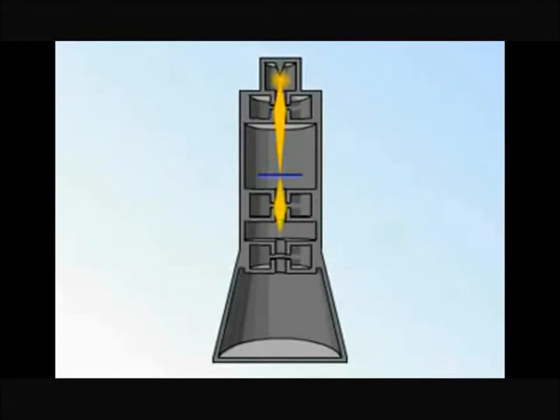Because different regions of the specimen are variously transparent to electrons, different amounts of electrons with changed energy pass through these regions. At the end of the tube, the electrons are collected on fluorescent or photographic film, or on screens that generate an image of the specimen.